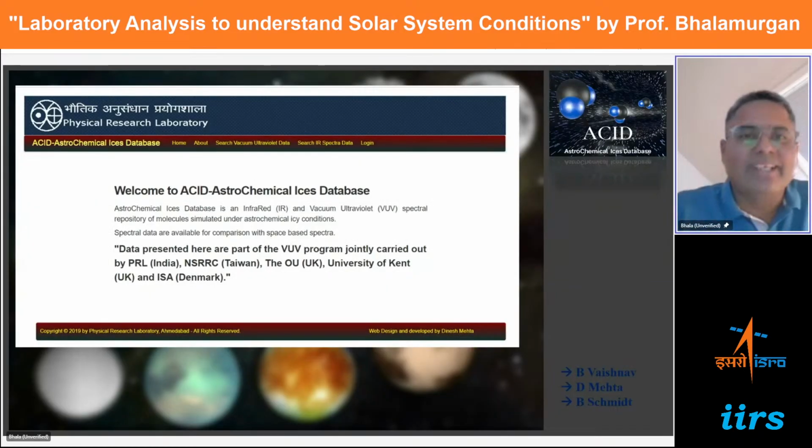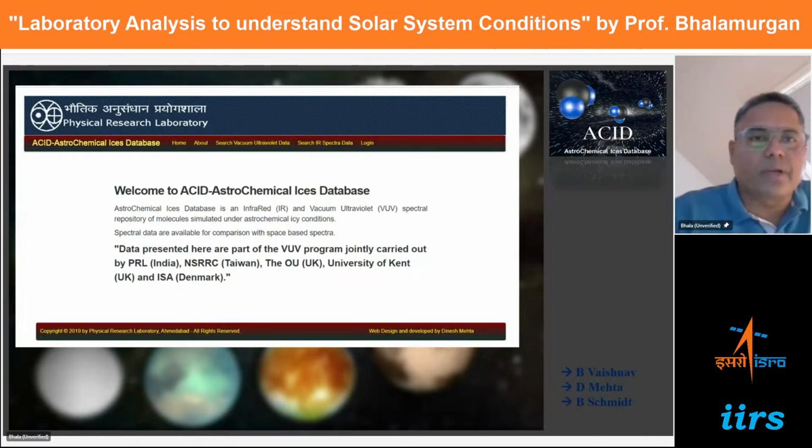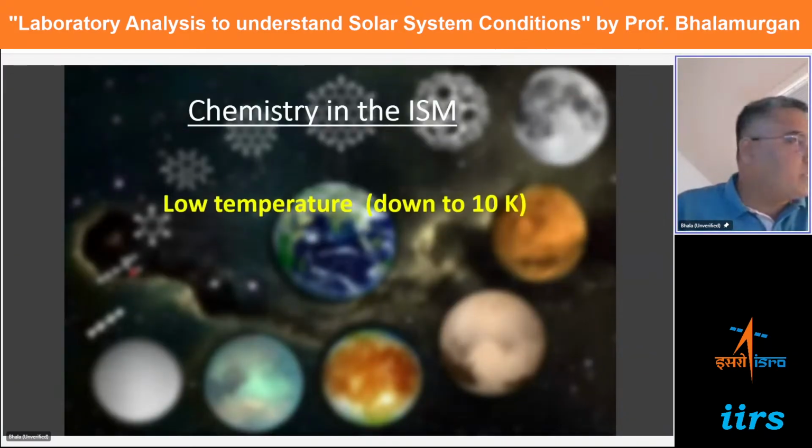No, I shouldn't skip this part. I'm sorry. So if you go to the PRL website and look for the astrochemical ice database, you will see that the spectrum that we obtain from our lab experiments are being loaded here for different molecules. So you can go and easily see. So you don't have to plot the spectrum. You can directly go and see the JPG files. We have given the JPG, right? So you can look for spectrum, the vacuum ultraviolet and the infrared. Okay. Right. So the low temperature part.